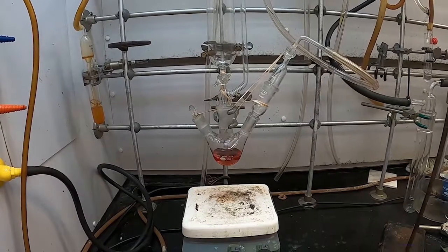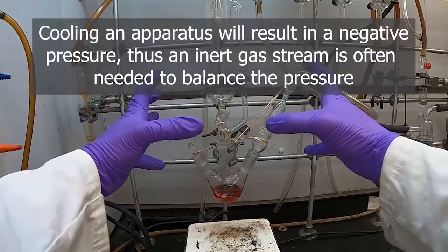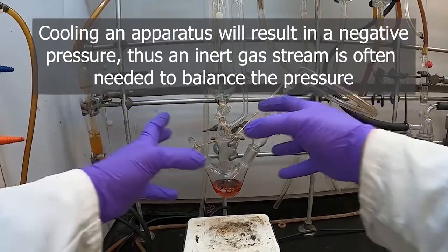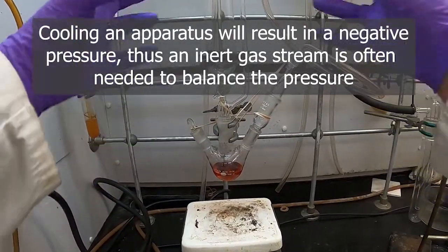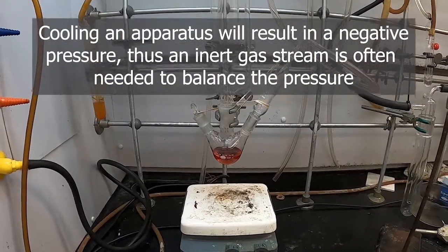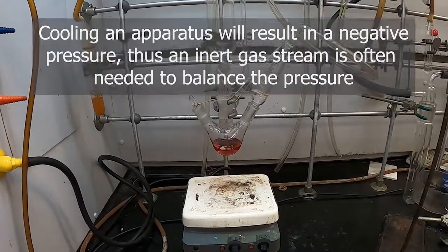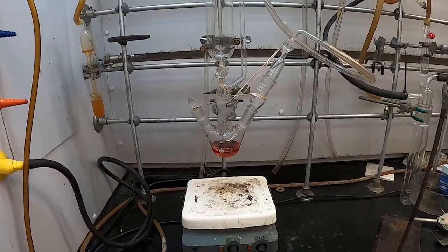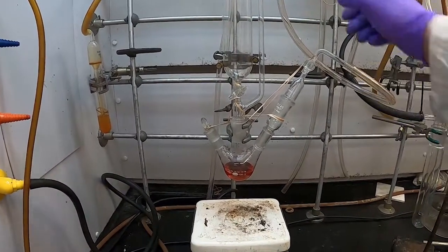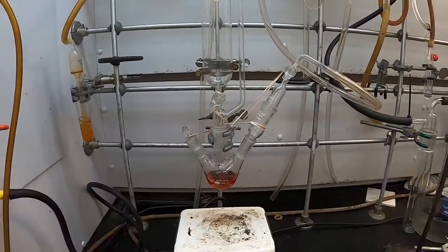One of the important things to do, especially with cooling, is to initiate a positive gas pressure. We can imagine that as this cools down, the entire system will contract, which will create a negative pressure inside the reaction, so air will want to push into our reaction. This is especially important with air-sensitive compounds, as things that require low temperatures might also be air-sensitive. To help reduce that problem, we can start with a nitrogen flow into our system so that we have a positive out pressure.